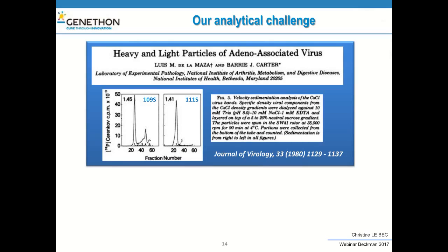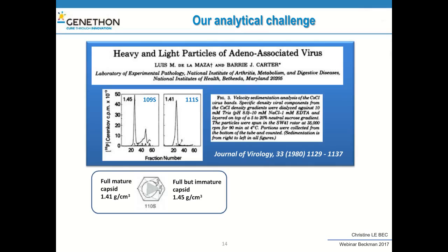At the beginning, we were basing on what was published in 1980. We know that AAV has heavy and light particles, for full and empty.